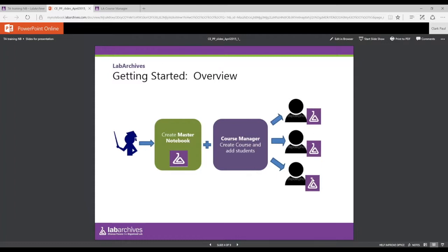When students get added to the course manager, they receive a copy of that notebook at that moment in time — much like the TA does. The TA gets a copy of the same notebook. With their copy, students can begin to engage with that notebook immediately. The instructor can add new material to their notebook and, when ready, push that out to students.